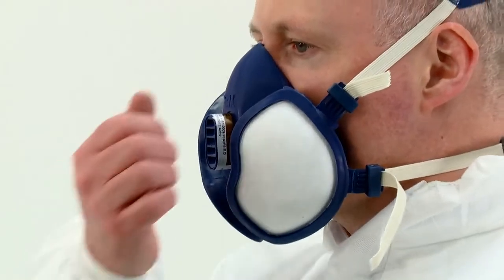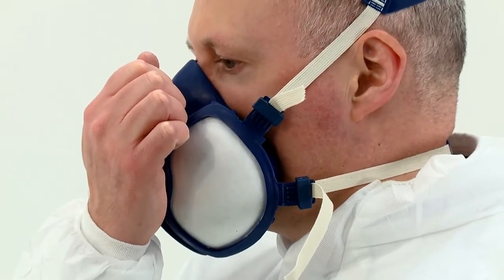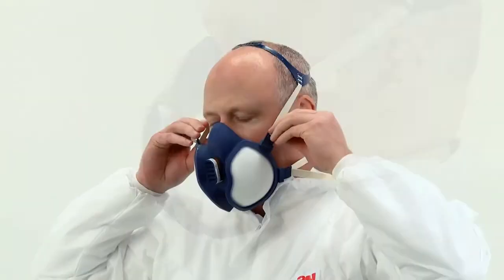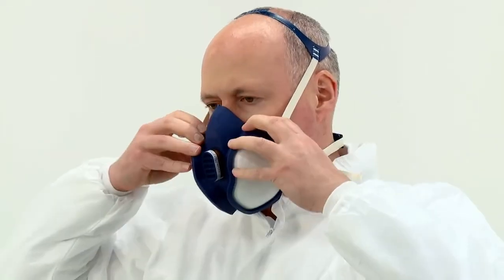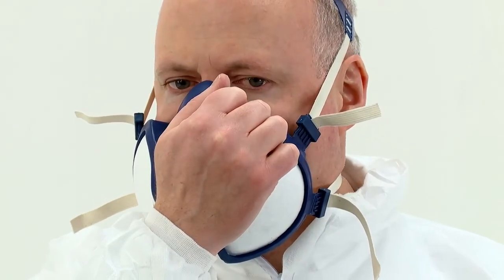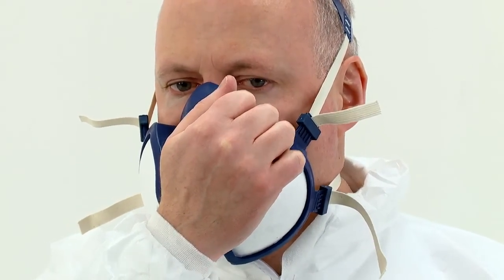If this occurs and there are no air leaks detected between the face and the face piece, a proper fit has been achieved. If it does not and you detect air leaks at the seal, adjust the fit, taking extra care with the tension adjustment of the straps. Then repeat the fit check. If you cannot achieve a proper fit, inform your supervisor and do not enter the hazardous area.